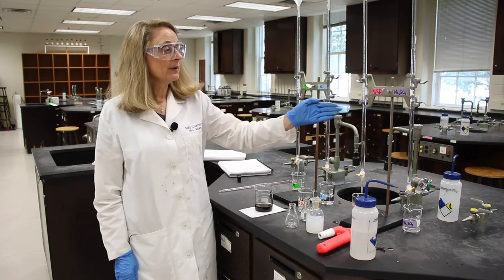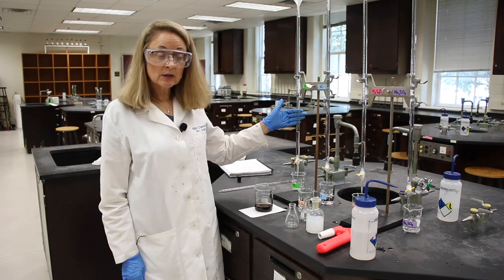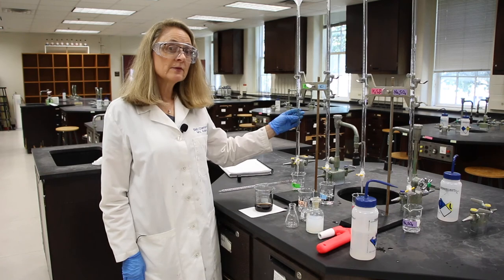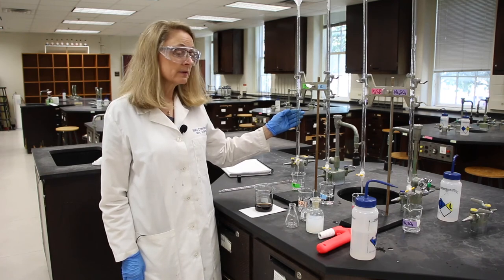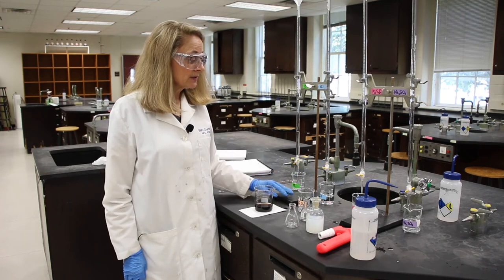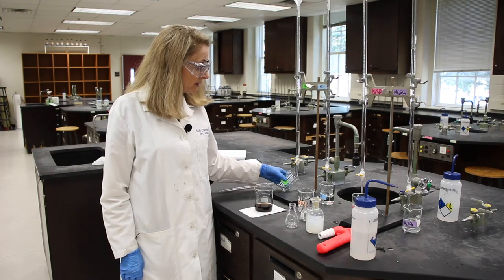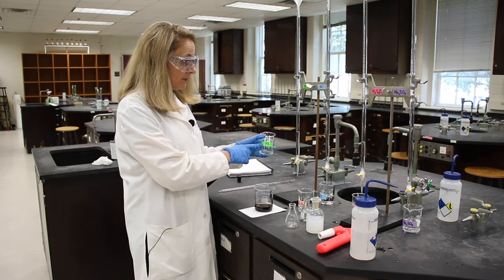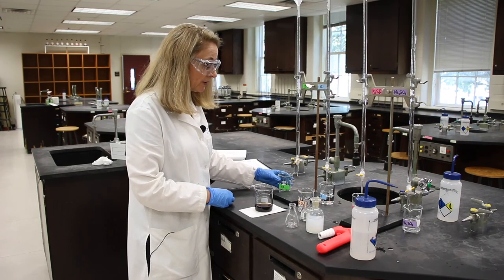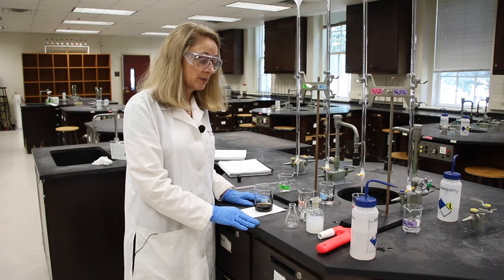We'll need to clean up our burettes. We'll need to drain these. All of these can go to waste down the drain. Rinse them with DI water, flip, and leave the stopcock open, signaling a clean burette. You can pour the remaining solutions down the drain also and put the beaker matched with the burette that it's supposed to go with. Put the remainder of your equipment in the middle for the next people.